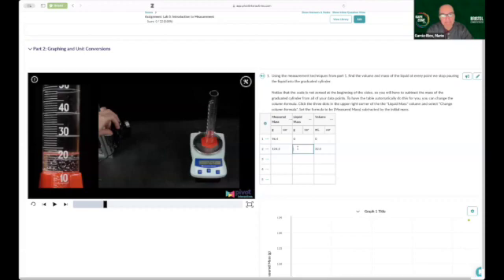Well, you can calculate the mass of the liquid by itself by subtracting 96.4 from 124.2 and then putting that number here. Or better yet, you can go to this column, click on the 3 dots, the ellipses, and check this out.